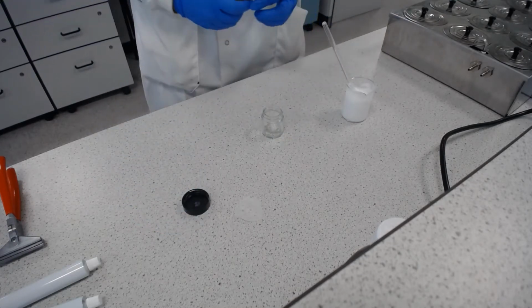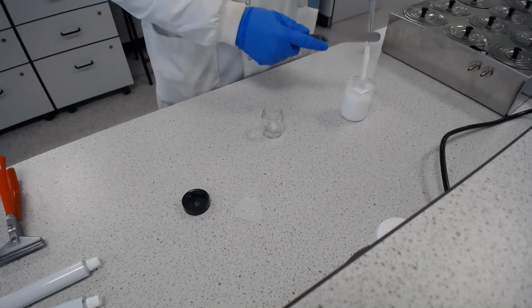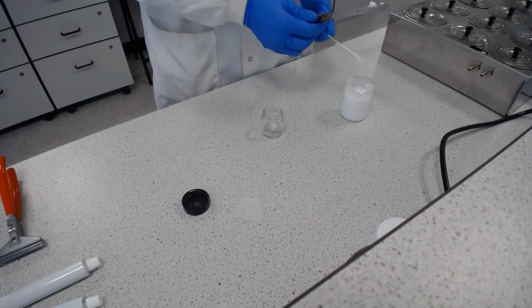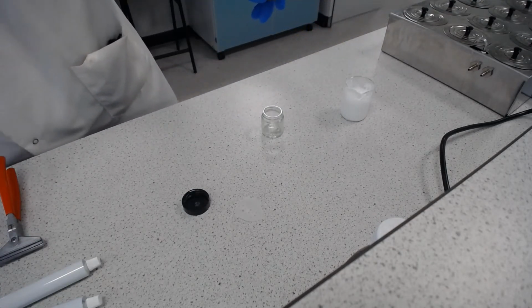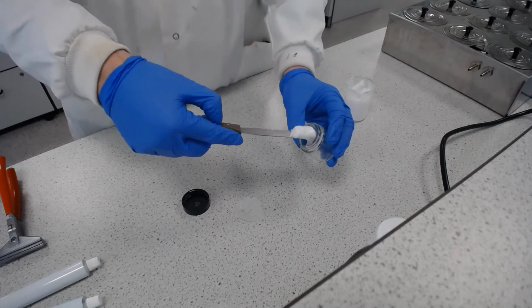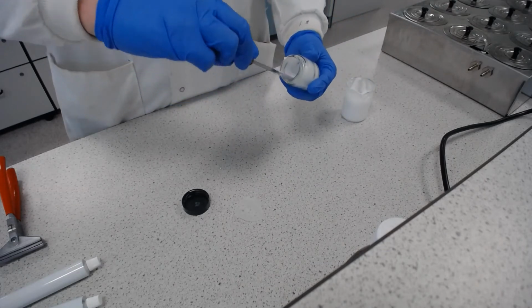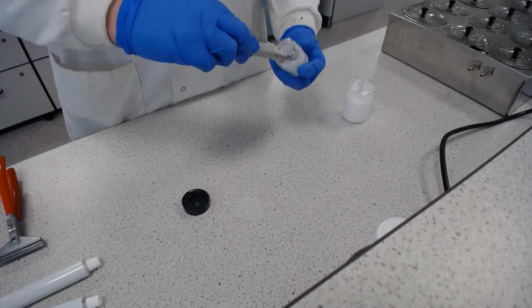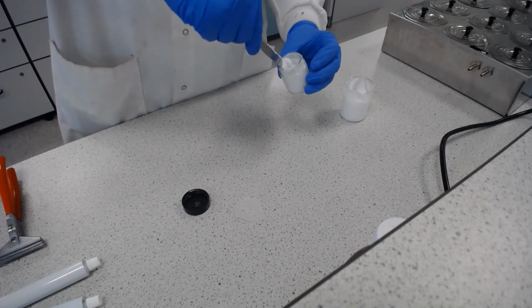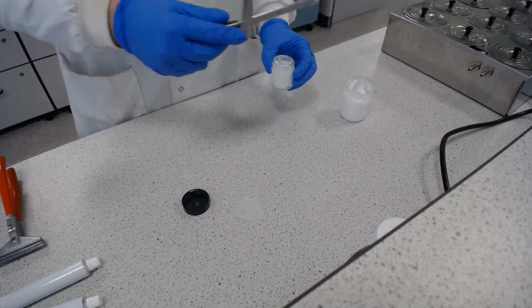And when we put it in, we're going to use a spatula or a palette knife, whichever one you want to call it. So I'm just going to clean off the stirring rod, put that down onto a bit of paper towel so I don't make the desk too messy, and then take a small amount, and then we're going to put that into the bottom and the side first. I'm going to do that all the way around to begin with, and by doing that we're going to ensure that we have cream all the way around the sides and on the bottom, so that we get a more elegant looking product at the end.